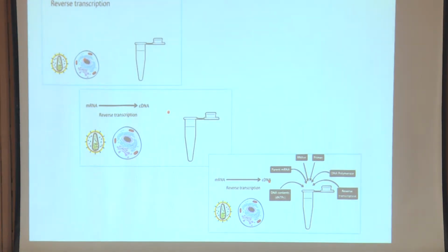That is all about reverse transcription. Many times in literature you will find RT-PCR. It's always confusing in biology, right? Is it real-time PCR or reverse transcriptase PCR? So much confusion is there in literature. Sometimes people call it qRT-PCR, sometimes RT-PCR, sometimes qPCR. I think the most accepted terminology is qPCR now. We all agreed. Let us not confuse too much. You simply call it qPCR. Okay, qPCR may be for absolute quantitation, it may be for relative quantitation. That you have to specify in your manuscript, what you are doing qPCR for.